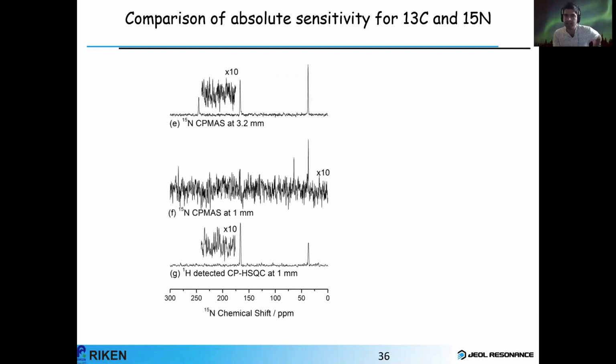Okay, so the next question is from Dahiana. Can you comment on the effect of hard pulses and soft pulses to excite different spins and the use of it? Hard pulse, soft pulse to excite different spins. What different spin means? I think they mean different kinds of nuclei.